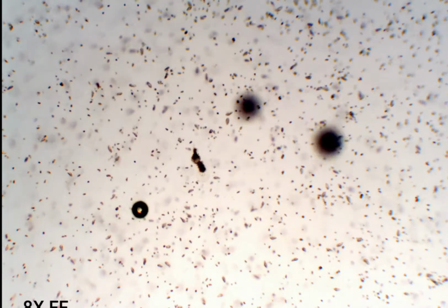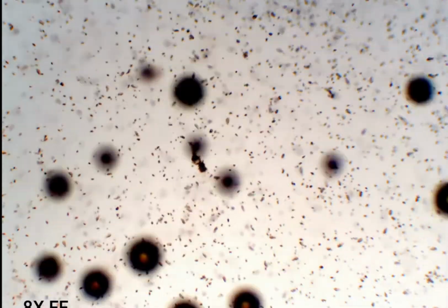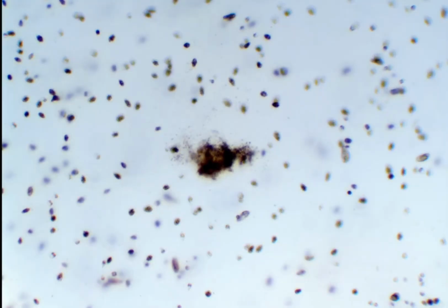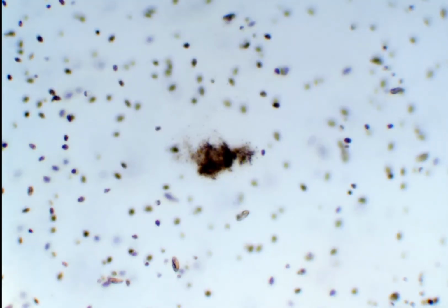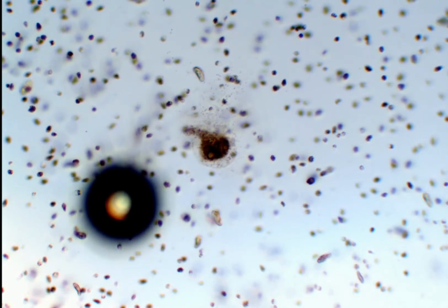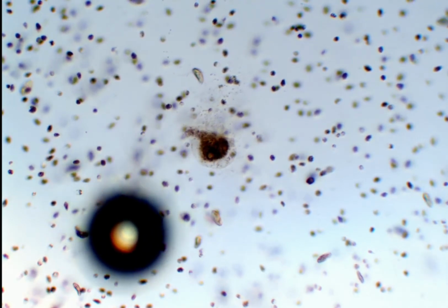So it's like they've started to go in circles. And now we see a colony of bacteria completely wiped off the map.